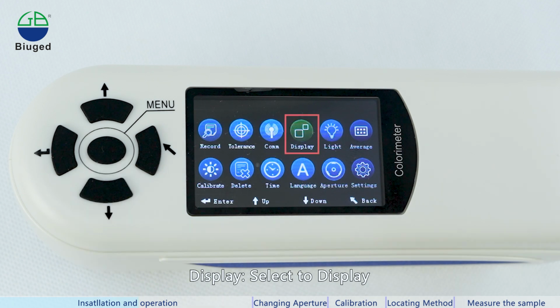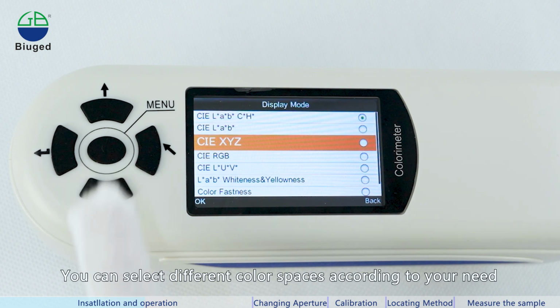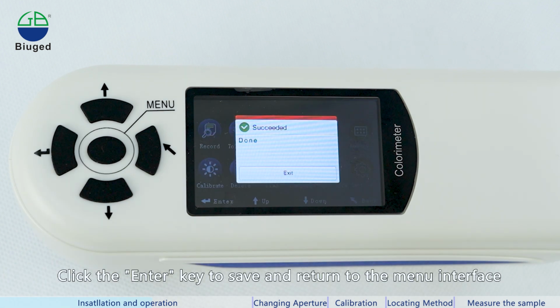Display, select Display. Click the Enter button to enter the display interface. You can select different color spaces according to your need. This selection will change the display in the standard measurement and sample measurement interfaces. Click the Enter key to save and return to the menu interface.